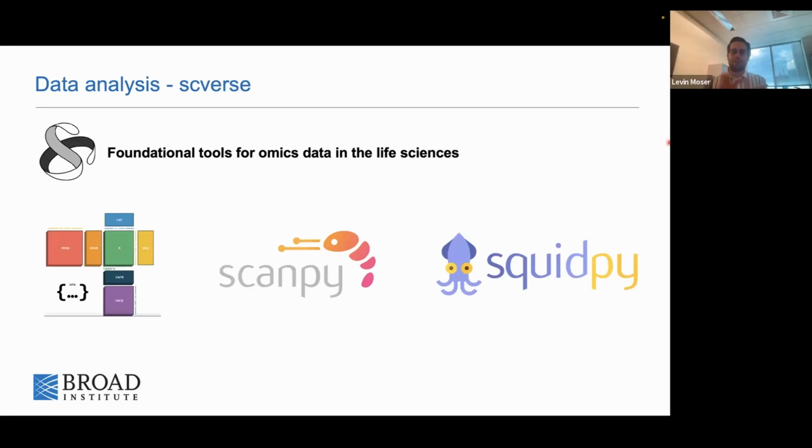And this is in contrast to what I said before. When we are talking about data analysis, there are a lot of really good tools out there, namely these. But when it comes to data processing, not so much anymore. I'm not 100% sure why that is, but I think a lot of researchers purchase the platforms from a vendor, 10x or Vizgen or whatever, and that usually comes with analysis software.